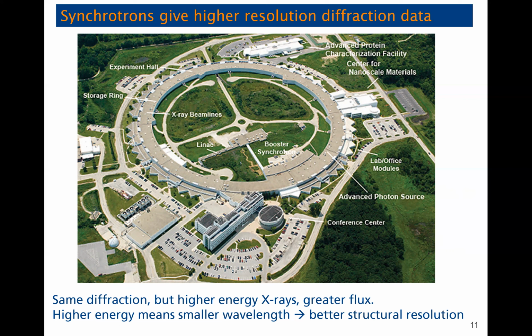So my group uses the sample mail-in program to this beamline quite regularly. This is a national lab that's funded by the US Department of Energy, meaning that you can apply for either time to physically be at the beamline, or what I do so far is apply for mail-in, and then you send them your samples and they run them. The entire thing is free for the scientist, funded by your tax dollars. And you get really high quality data, so it's pretty exciting that we're able to use a resource like this.